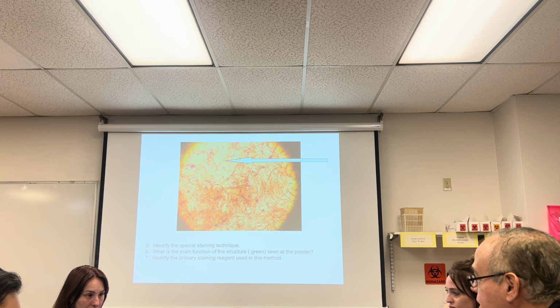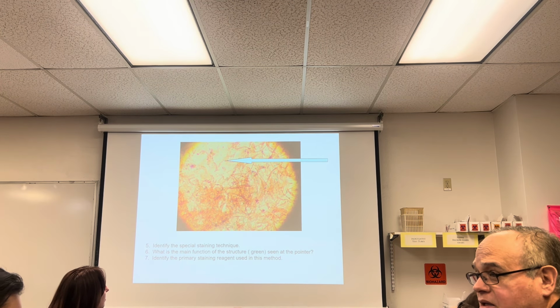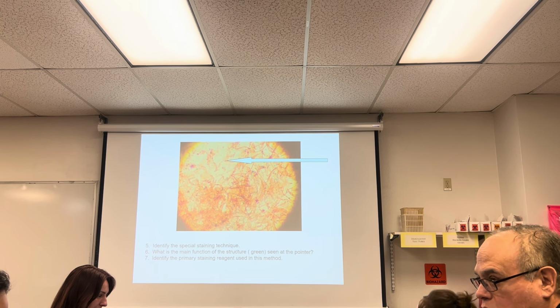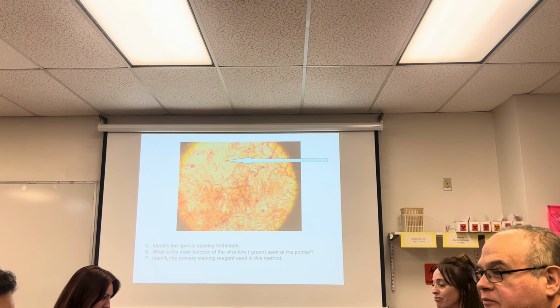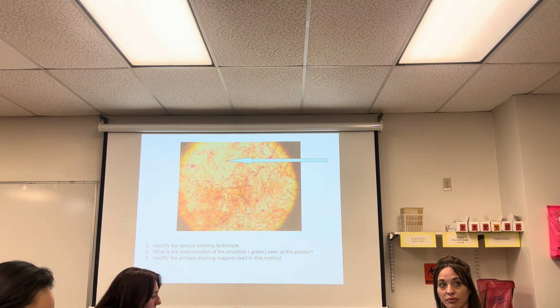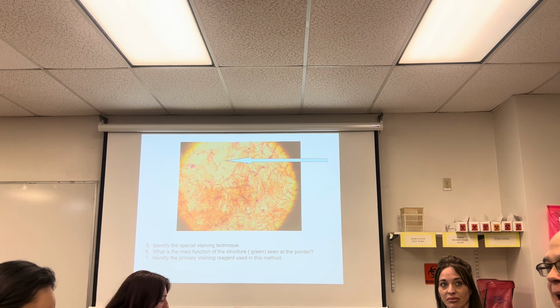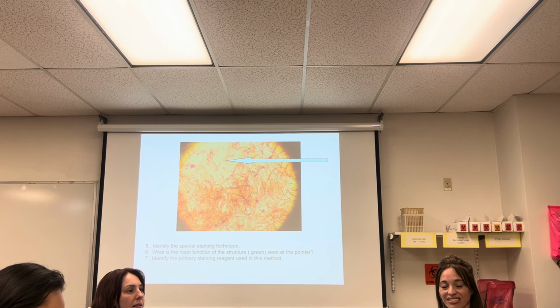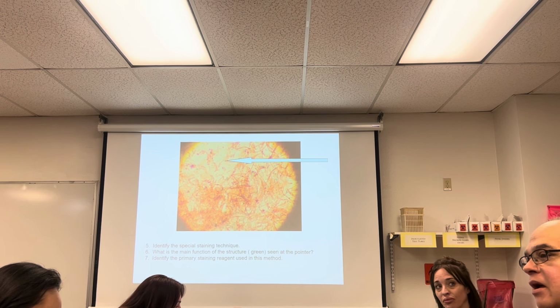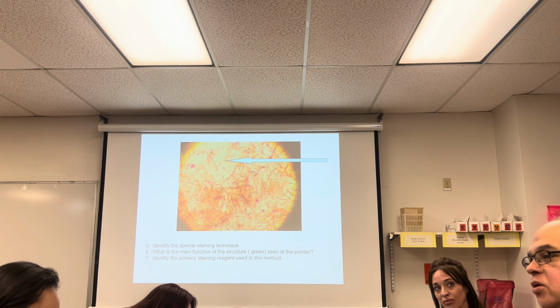Okay, now, what is the primary staining reagent in this methodology? Malachite green. And it can't just be malachite, because then you're talking about a stone. Words have meaning. But if you spell it malachite, to rhyme with parakeet, I'm still going to count it right because I can phonetically understand what you were trying to tell me. Okay? But if you mean malachite green and you say malachite blue, that's wrong.